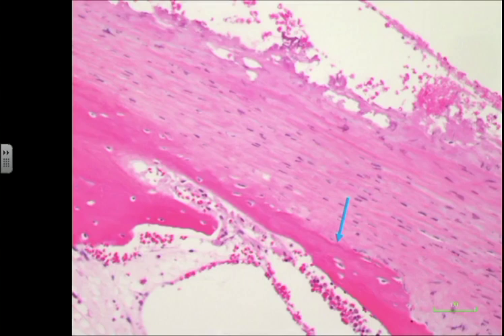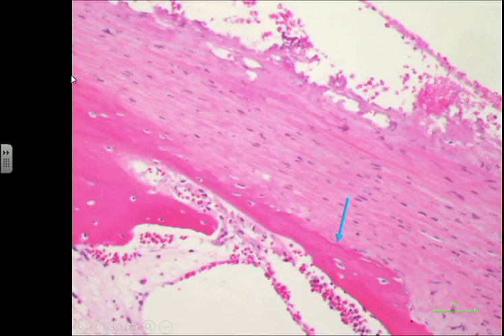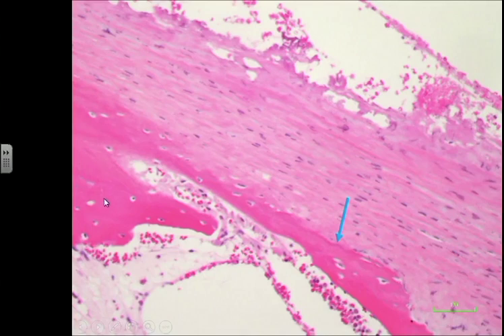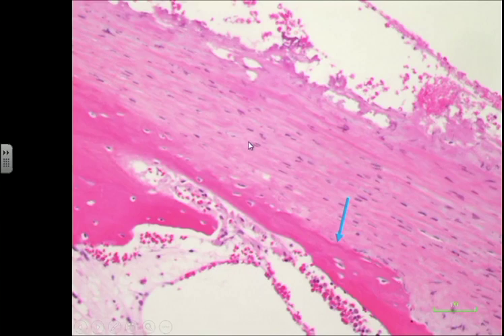The first one we'll speak about is periosteum. You can look at periosteum and consider it as part of bone, or it's the fibrous covering of bone. This is a cortex of bone — we can see that it's homogenous pink material. But just on the outer side of it, we have this fibrous tissue. Compare the fibrous tissue color to the bone matrix: bone matrix is very homogenous, dark pink material, while fibrous tissue is much paler. You can see a lot of cells in between it, which represent the fibroblasts.